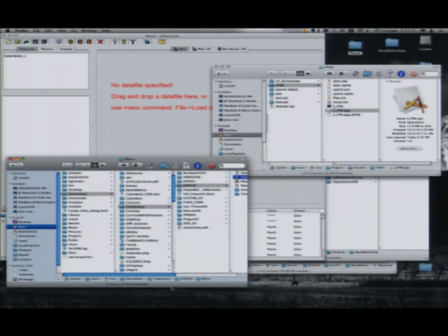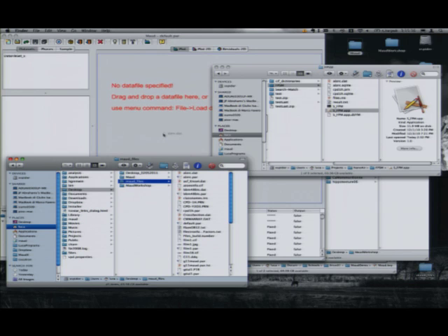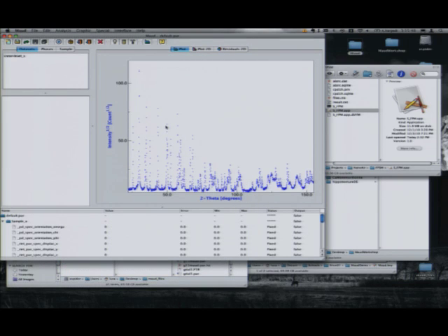How much time do I have actually? 5 minutes. So okay, I just show quickly how I work normally. So let's say I have some data. We can use one from the desktop here, a MAUD file. So one is this aluminum and tetragonal zirconia, okay?